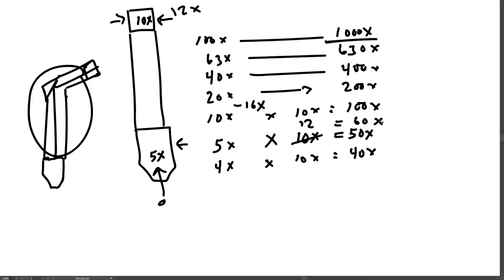You can't come up with a magnification in between 5 and 10, like 7.5, unless you could find a 7.5x objective. But typically, when you sit down at the microscope, you have the 5, the 10, the 20, and so on, and 40, and 100.